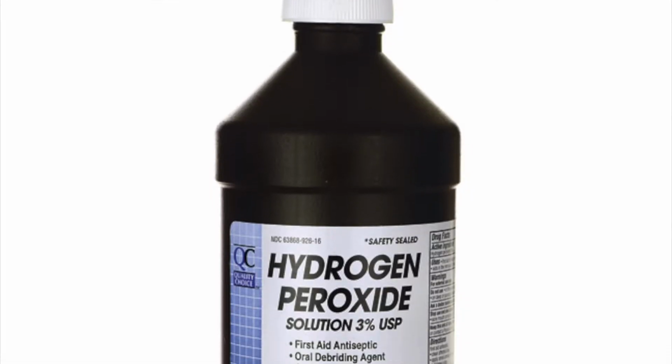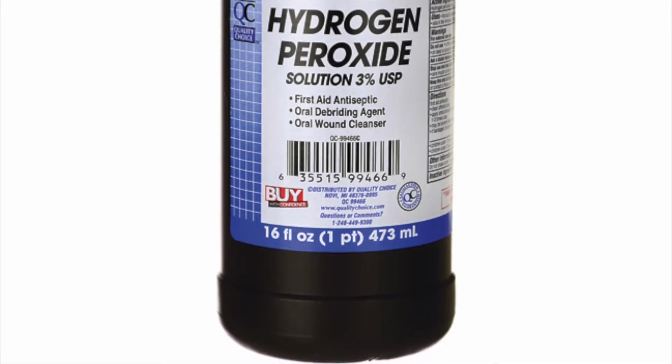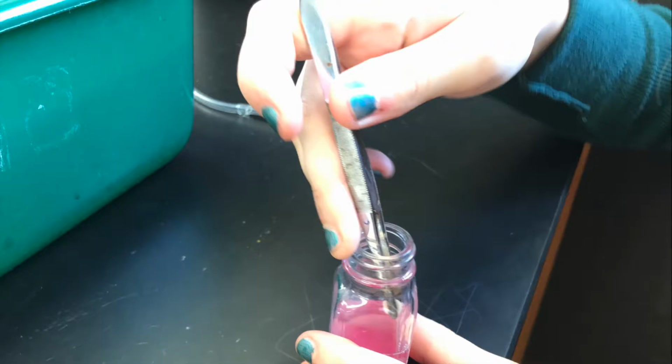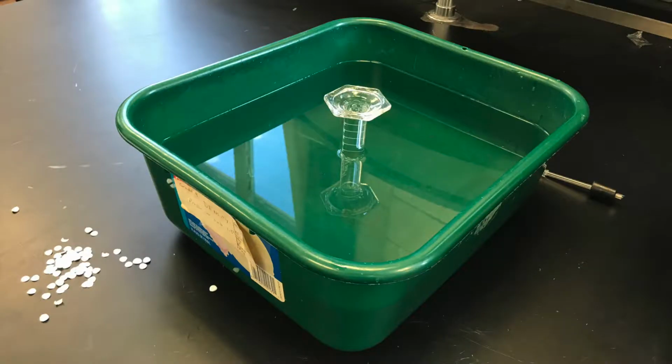To conduct our experiment, we first added 10 milliliters of hydrogen peroxide to our reaction chamber. We then soaked a paper disc in catalase and stuck it to the wall of the reaction chamber. We inverted a graduated cylinder and submerged the reaction chamber underwater to observe as the oxygen from the reaction was collected in the graduated cylinder. This was our control, and we repeated it 3 times.